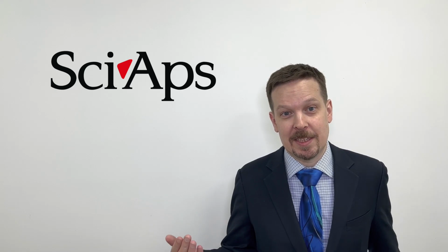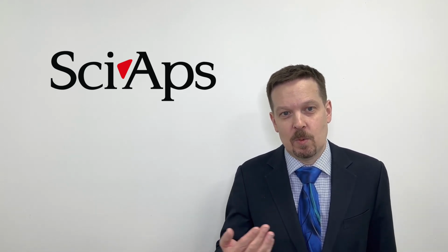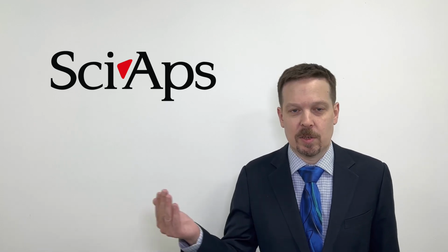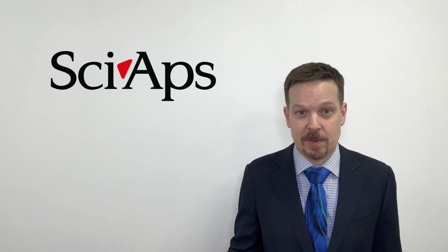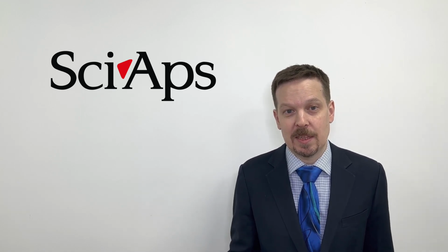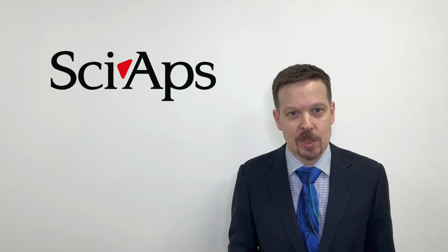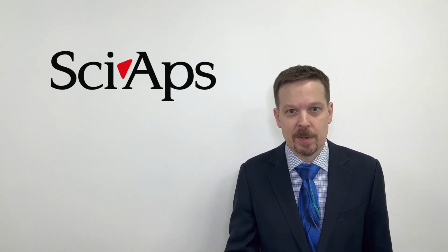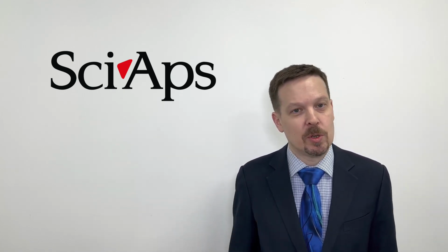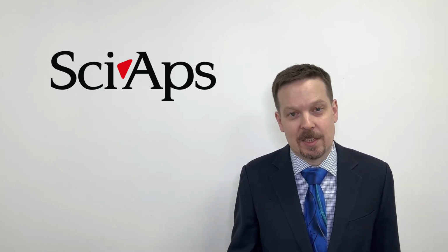And with SciAps LIBS, it allows you to see elements that you weren't able to see before with traditional XRF analysis or other types of analysis. And really the biggest advantage to using LIBS is that you don't need all this preparation to do it. It's very simple. Just grab, point, and shoot. And you can save yourself a lot of time and energy with your analysis programs.